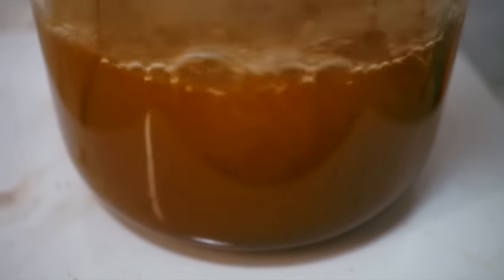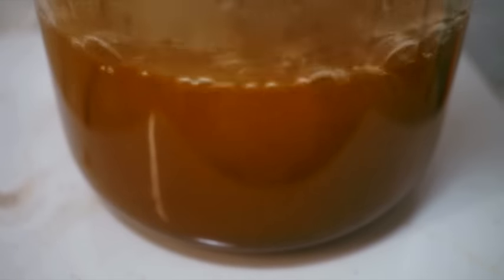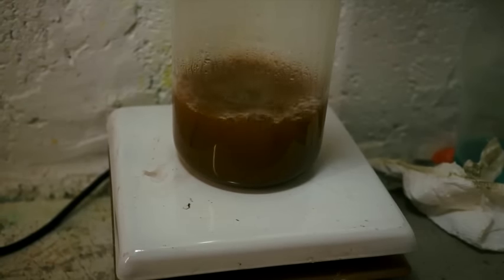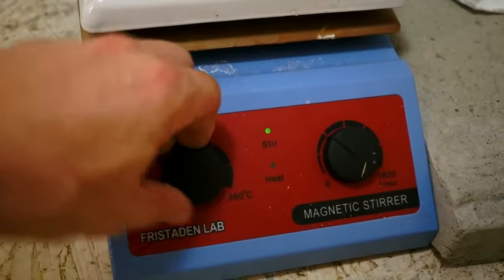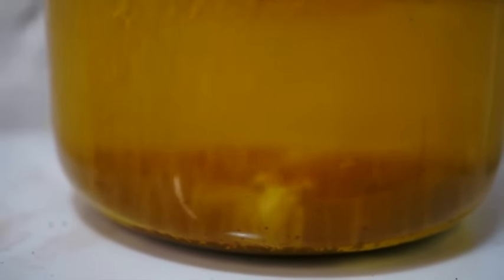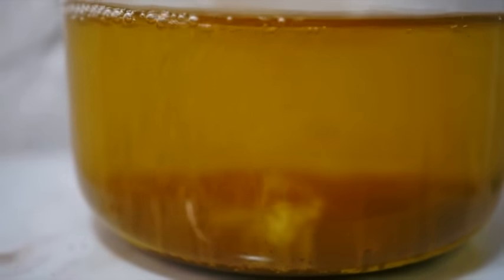As the hydrochloric acid boils, it will react with any remaining contaminating metals that are in the gold powder. You can see the solution has become considerably darker. Remove from heat and allow to cool. There is definitely more metal dissolved in this solution, most likely iron.